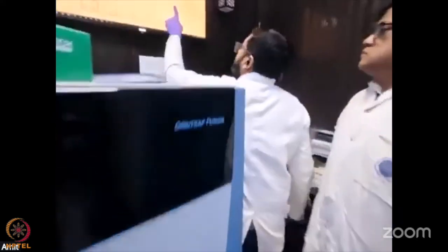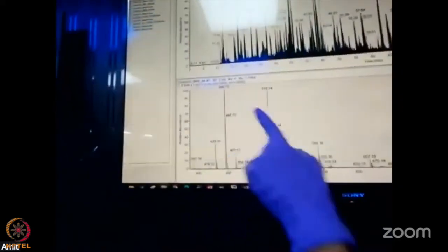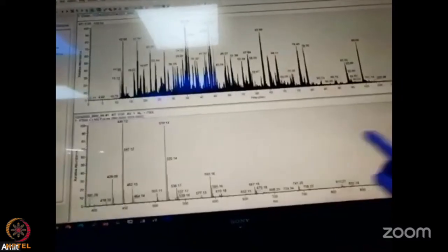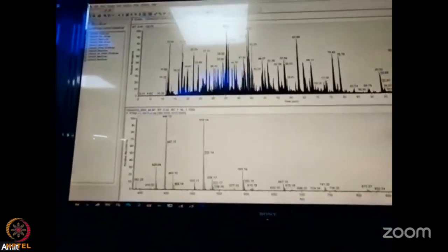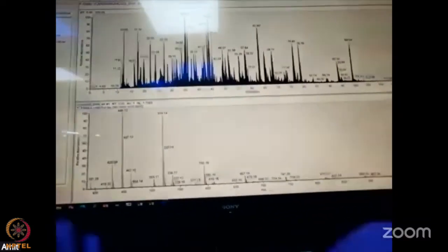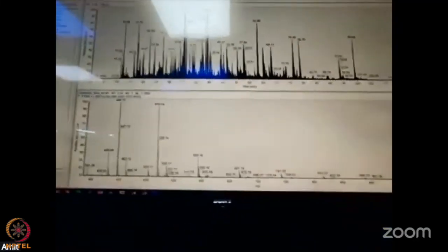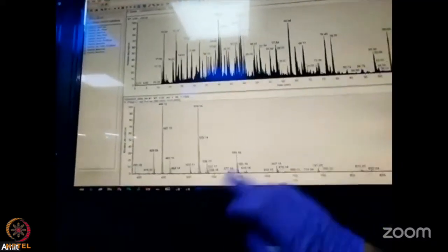Now I'll show you something. When you run this, you will get this kind of chromatogram. It runs from 0 to 120, which means we are giving a 2-hour long gradient where the peptides are being eluted out. We go from lower hydrophobicity to higher hydrophobicity, and the peptides are eluted at each phase. As they elute, they go to the detector and we see the intensity, which is in the range of E9. The maximum intensity of the precursor is E9.